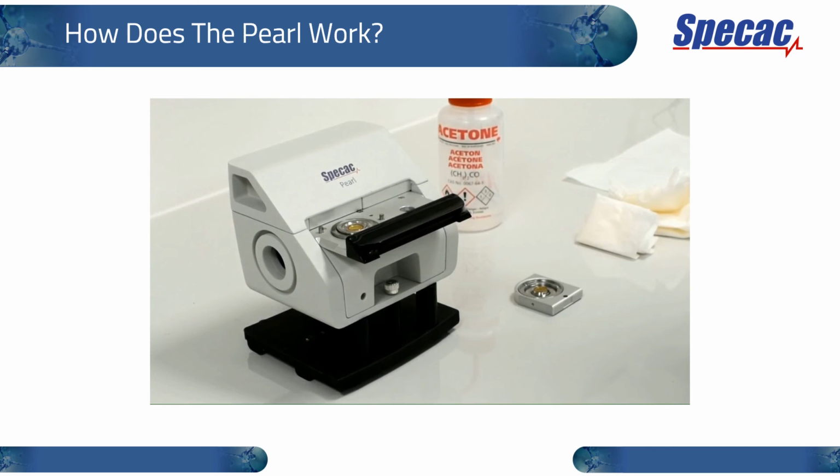After a few seconds to air dry, your cell is then ready for the next sample.